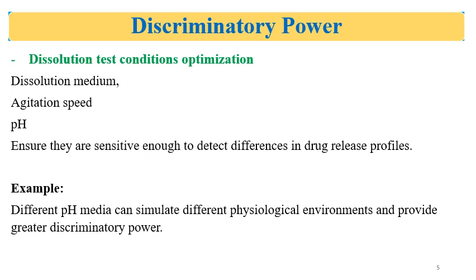If you are working on dissolution for a tablet formulation, you are using the paddle apparatus, and you are developing the method with 75 rpm or 100 rpm paddle speed, then it will be very difficult for you to justify or prove the discriminatory ability of the formulation using that dissolution method.